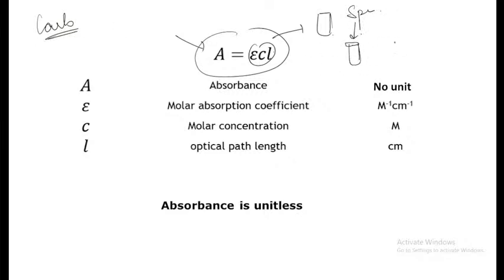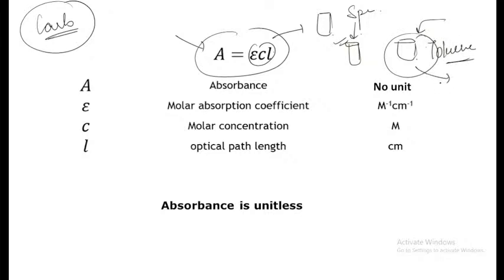Depending upon the variety of content, various types of cuvettes are used. For example, for carbohydrate and starch, we use simple plastic cuvettes, but for toluene we use a glass cuvette. Why? Because depending upon the nature, we use different thicknesses of cuvettes. This is what is actually getting done here.